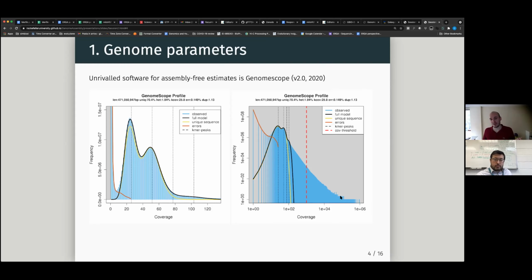Here we're talking about 1 million copies. So actually this is useful because, as you can see, there is also an estimate here about the fraction of the genome that is unique versus the repetitive fraction of the genome. So we're talking about, in this case, 70%. And again, complex formula, but the idea is that whatever is under the black curve is your unique fraction. Whatever is left to the right is your repeat fraction.